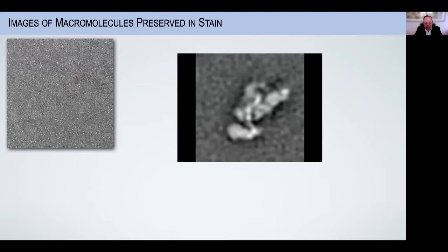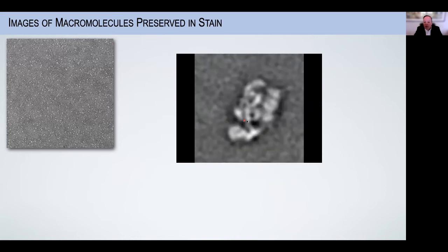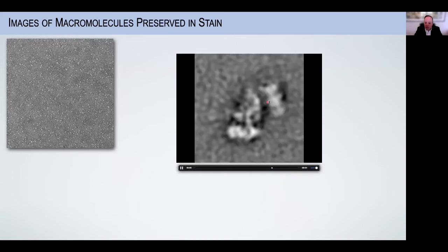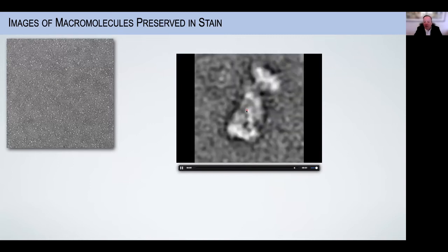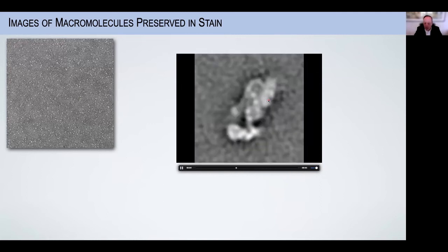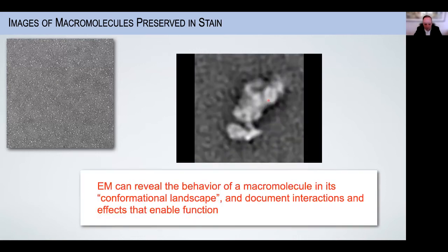Although this seems primitive compared to cryo, it can actually provide a very large amount of potentially very interesting information. It is used to check for homogeneity and purity of the preparation, and it typically provides 2D class averages, such as the ones shown here. Besides doing that, comparison between those class averages can give you already a lot of information about the conformational dynamics and interactions of the complex, as shown here for a specific example with a mammalian transcription regulation complex.